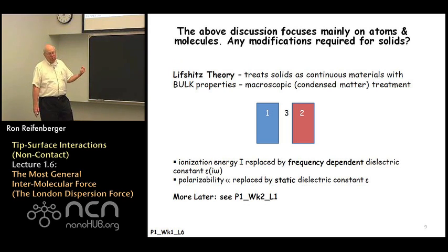So the Lifshitz theory does not emphasize atomic or molecular parameters. It emphasizes the dielectric properties of the solids that interact. And we'll discuss that Lifshitz theory in a little bit more detail in week 2 of this course. So if you stay tuned, we'll run through a quick discussion of the advantages the Lifshitz theory might offer.